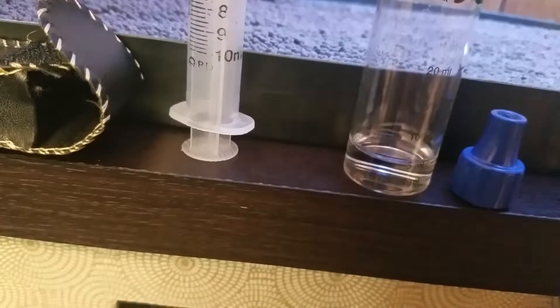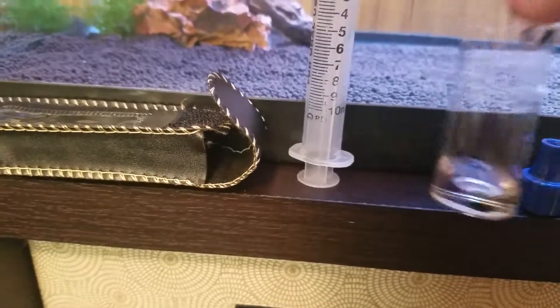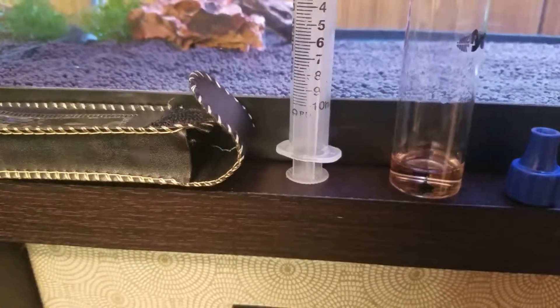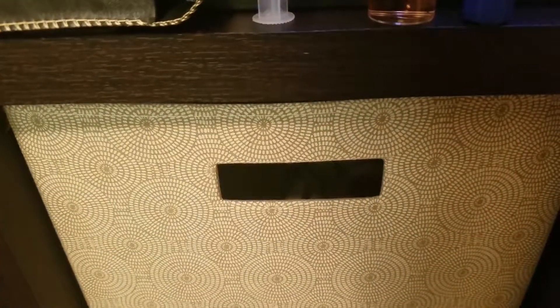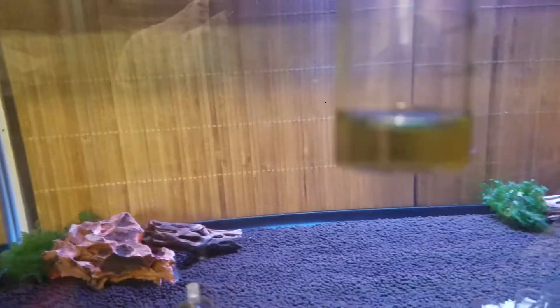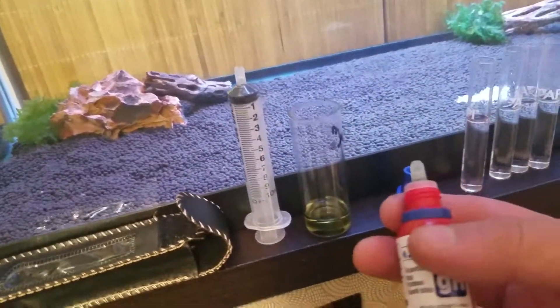First drop goes in — you swirl it around. There's one. There's two. Notice the water is a little red, it's not green yet. There's three — still a pinkish. There's four — it's beginning to turn. She's green now. So my GH here is four.